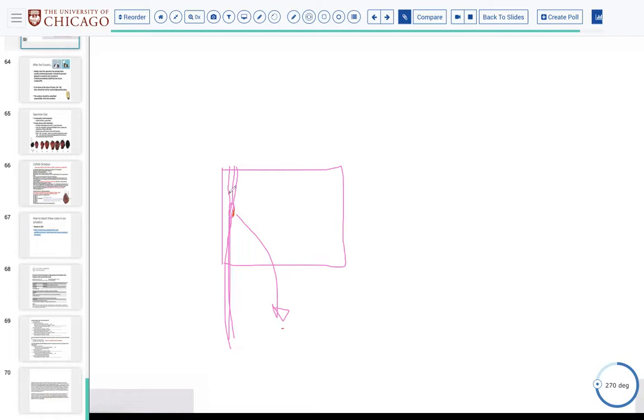So I would advocate for more sections at the time of frozen, because it's already embedded, it's already faced, and that is the most important time period with which your surgeon needs an answer, right?